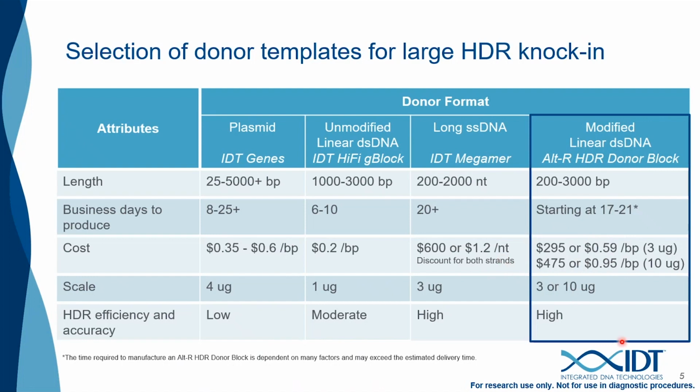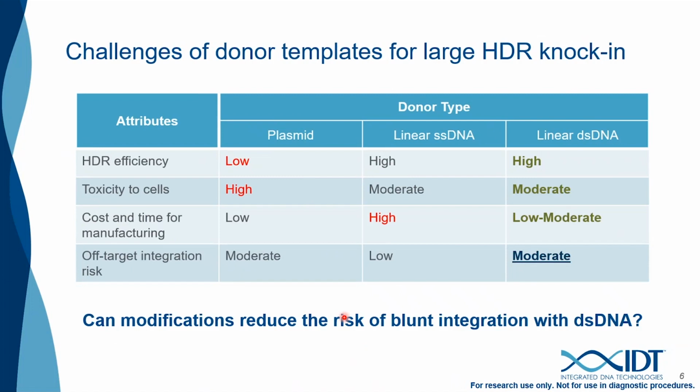And lastly, the modifications added to the HDR donor block offer improvements in HDR efficiency and particularly in accuracy over the unmodified double-stranded DNA. So taking a step back now, we'll discuss why we focused on a modified double-stranded DNA template.